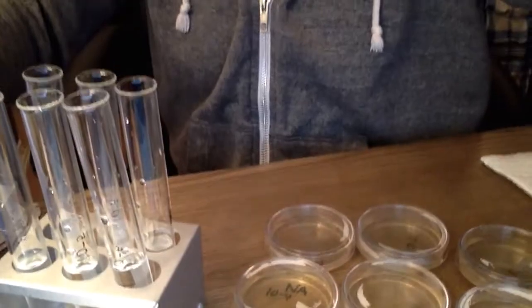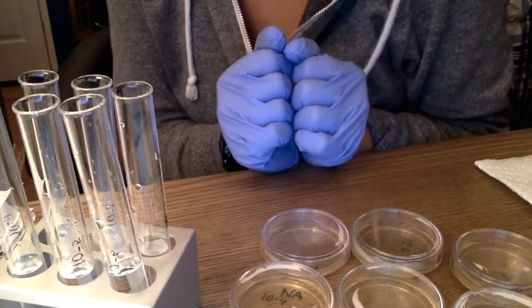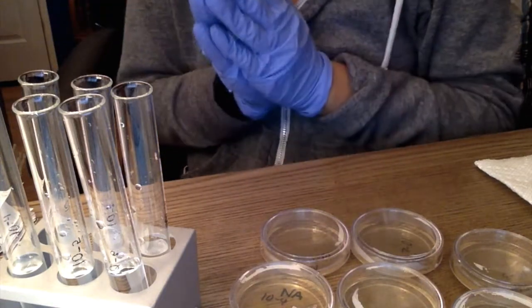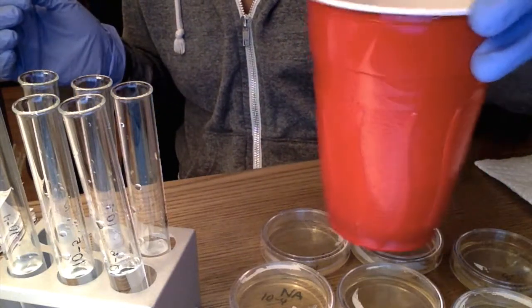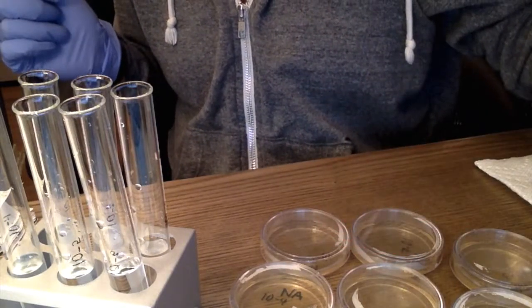And in this video, as you can see, I am currently preparing dilutions in order to observe the degree of exponential growth in the culture S. cerevisiae. So, the first thing I did was I mixed up the yeast in warm water solution. I let it sit for about 10 minutes to froth.